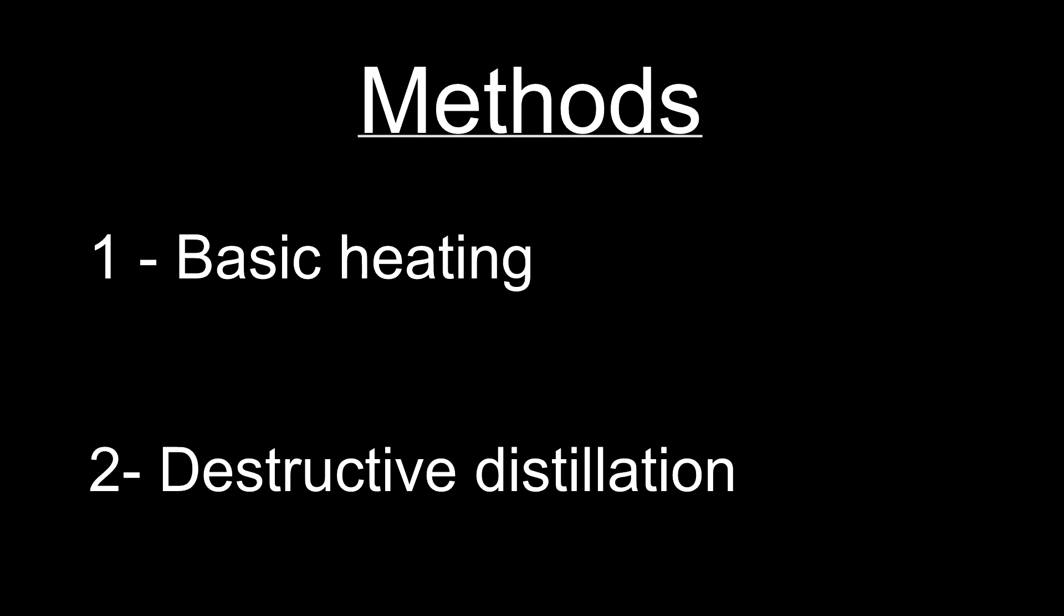In this video I will be using two basic methods. The first is just the basic heating of the lysine and the second is an example of destructive distillation.